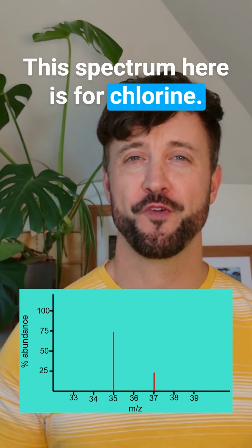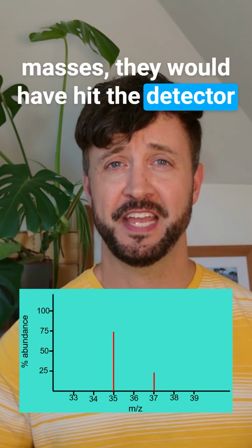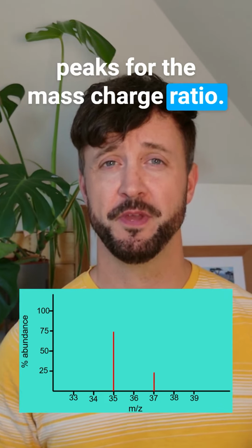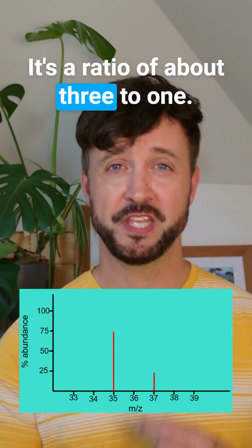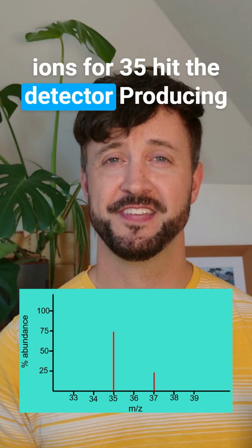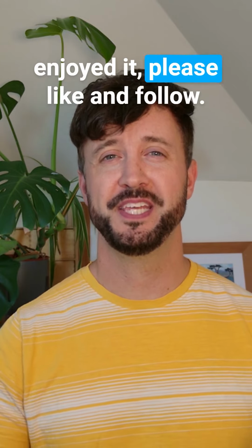This spectrum here is for chlorine. Chlorine has two isotopes, chlorine-35 and chlorine-37. Now, because they've got different masses, they would have hit the detector at different times. This would have given us different peaks for the mass charge ratio. Secondly, there's different amounts of each of those two isotopes, 37 and 35, in the sample. It's a ratio of about 3:1. That means 3 times as many ions for 35 hit the detector, producing a current 3 times the size of the current for chlorine-37.